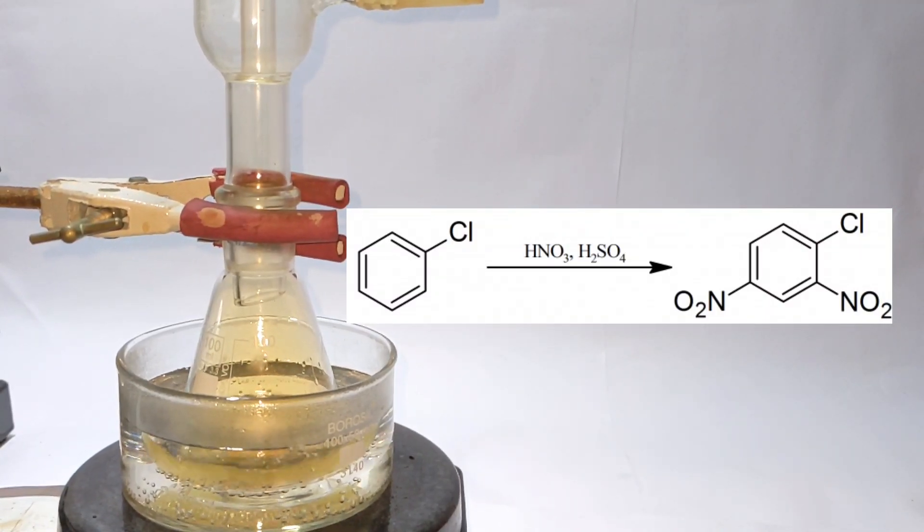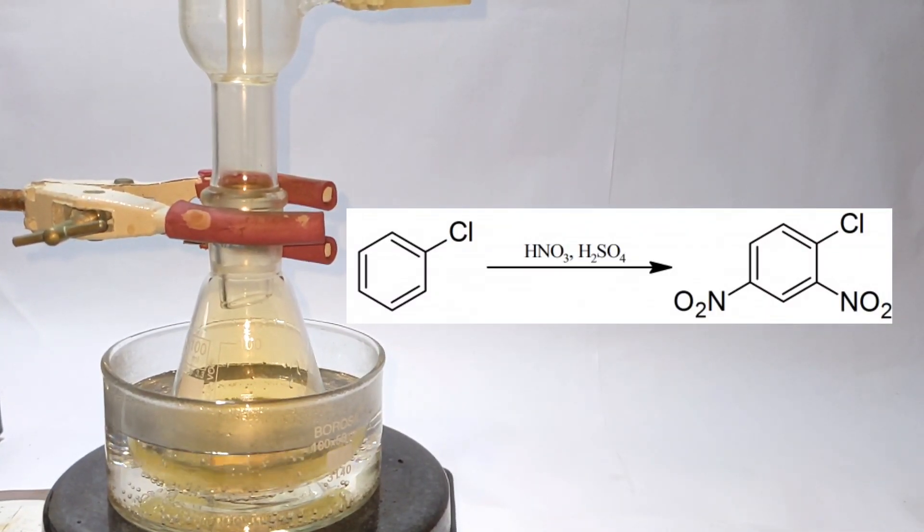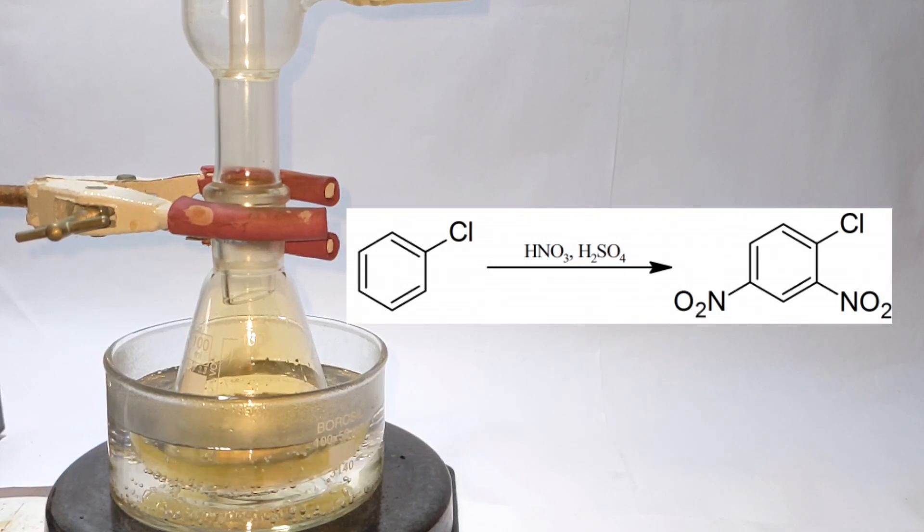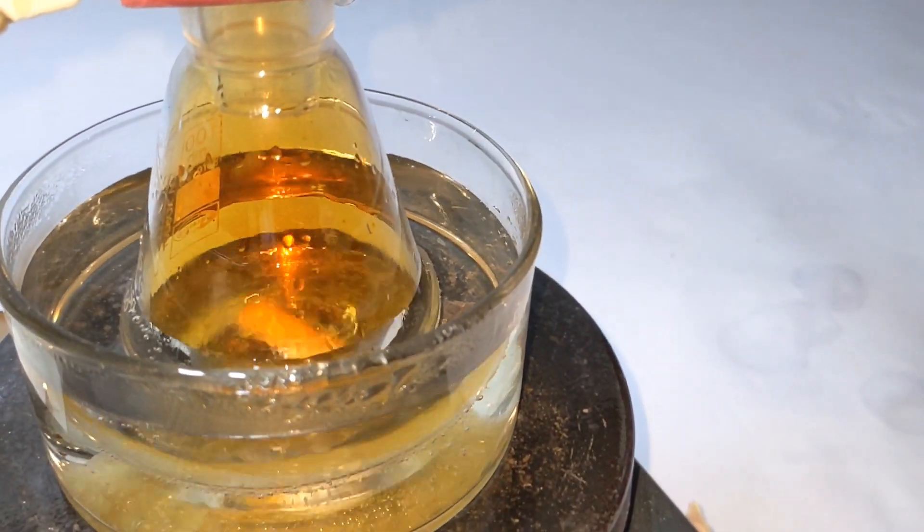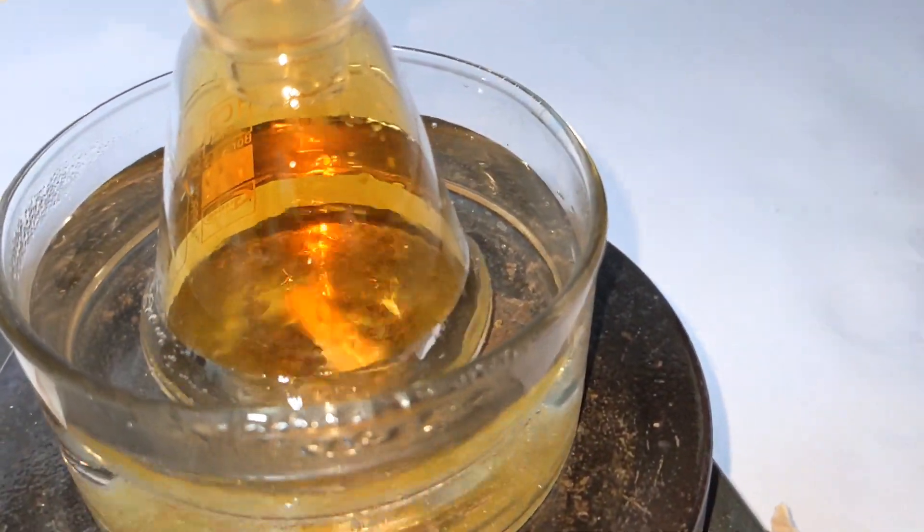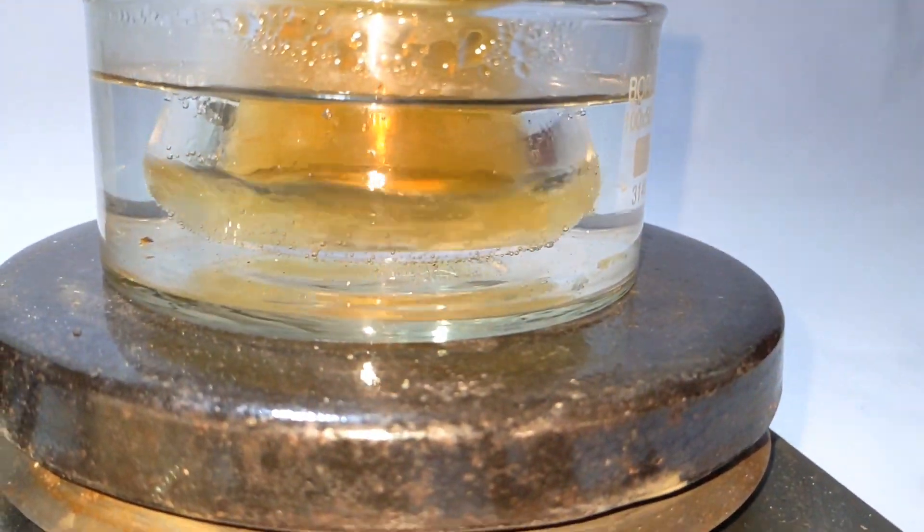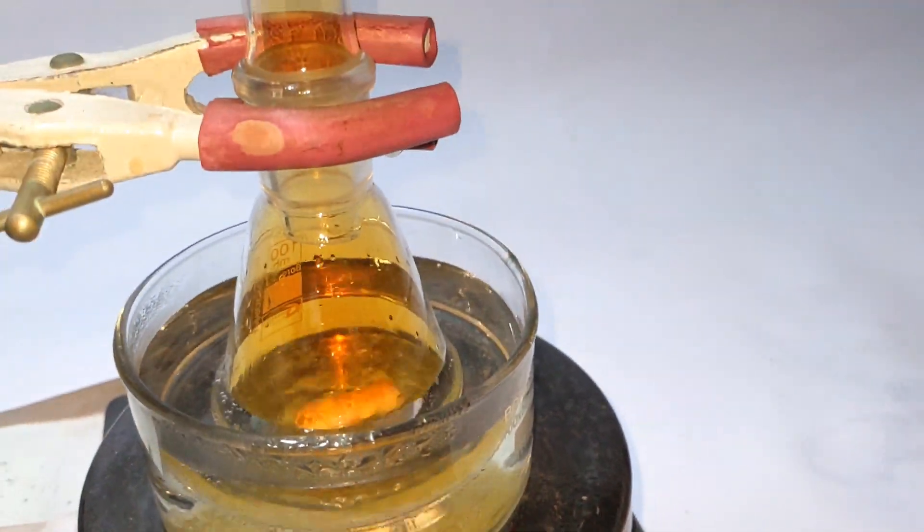What's happening here is the nitration of chlorobenzene to form 2,4-dinitrochlorobenzene. A point to note: nitrogen dioxide is toxic so either perform this in a fume hood or outside in a well ventilated area.